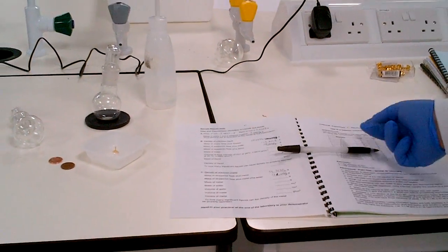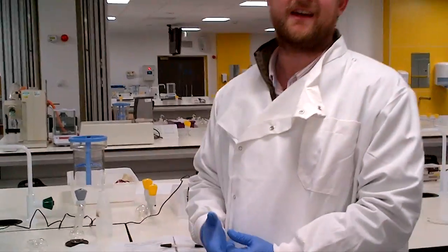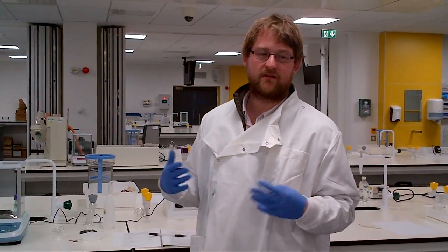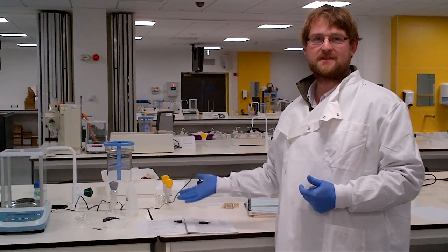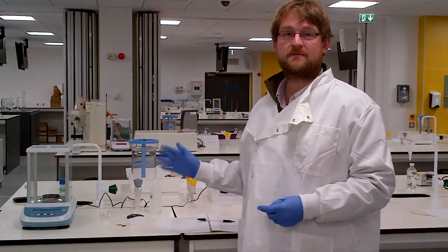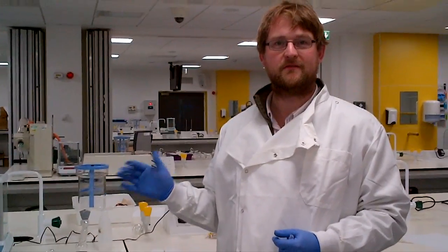And this is a very important principle when you do chemistry, either in a foundation year or towards a first, second, third year, or an undergraduate degree, honours degree, or an MSc and PhD. Get to fill in data tables, record masses of flasks, record and scribble them down somewhere. You've got a data sheet for this today. So this is chemical experiment 3, and I thank you for your attention to this video, and we stop.